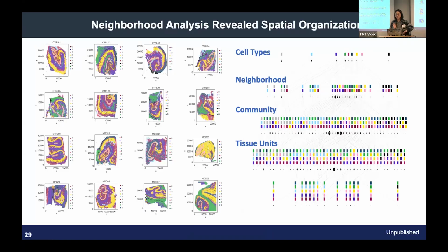The beauty of it is that if you have no knowledge to annotate every human brain tissue, you can just run a neighborhood analysis. And this is what the machine can detect as conserved neighborhoods in the human hippocampus. All of the yellow regions are annotating the pyramidal neuron layer in the cornu ammonis, and all of the pink layer annotated here is targeting the granular neuron layer in the dentate gyrus.